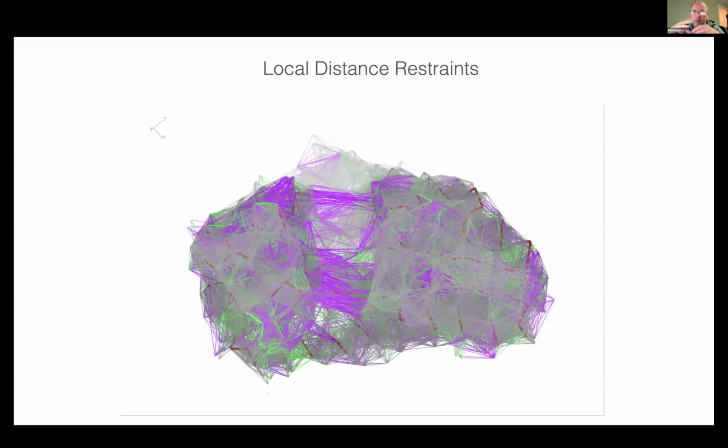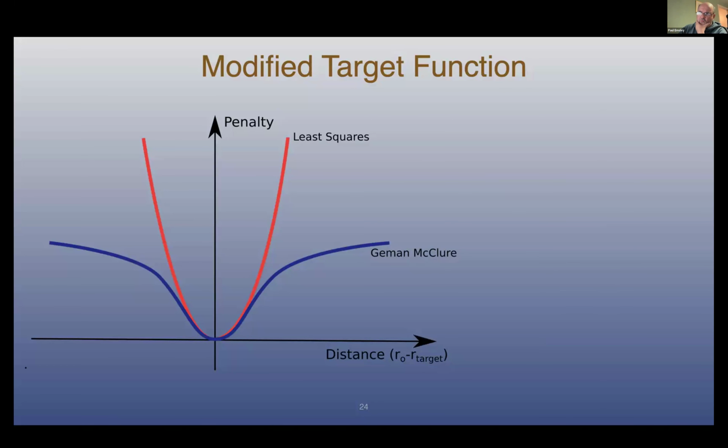They're longer in today's model, which doesn't have the ligand, and so the ligand binding site's opened up a bit, and the distances between these atom pairs are longer, and so they can be edited, removed if you like. But the weighting system of the scheme, as you'll see in a moment, is robust to allow this kind of long range distance difference and still be robust.